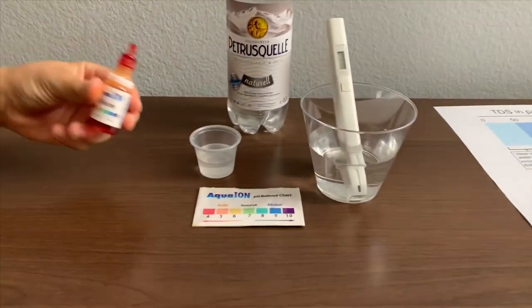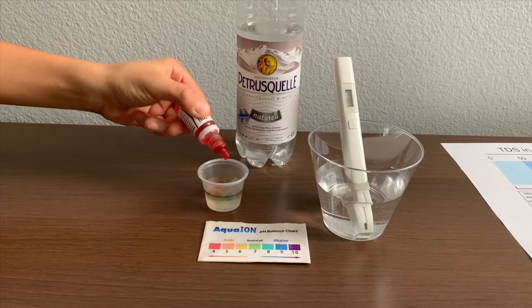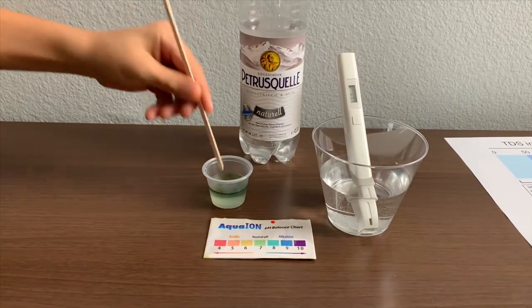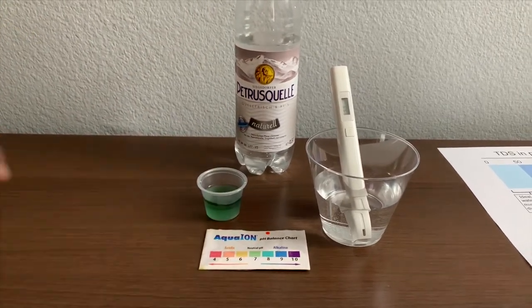Now let's test the pH level. Only do two drops. Let's stir it a little for a better result. I give this an 8 — this is alkaline water.